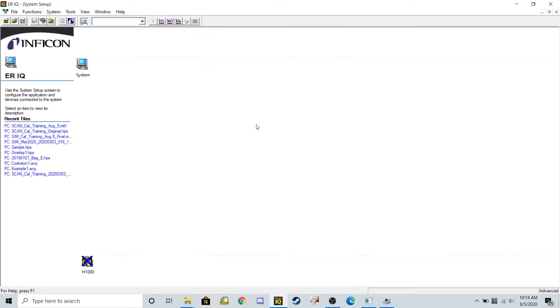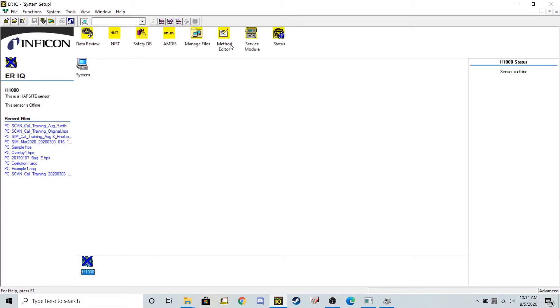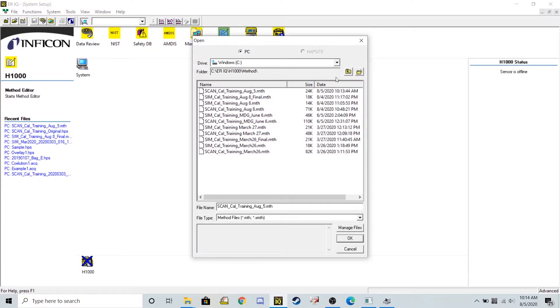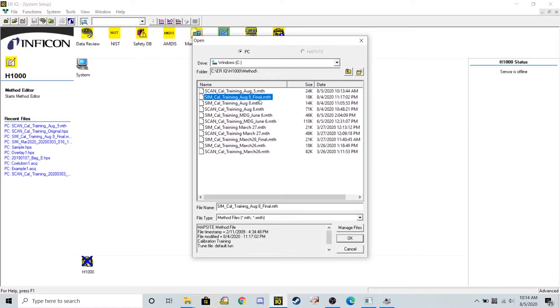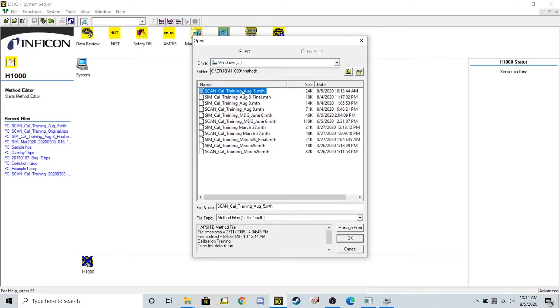What I'm now going to do is use our method editor, this yellow tab at the top, and I'm going to pull that method into here, the method that we just created. So I think it was August 5th.